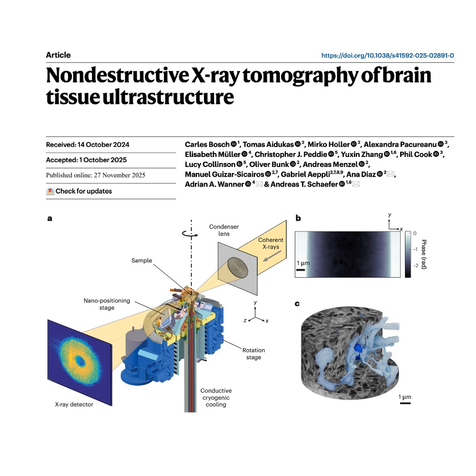So they took the same piece of brain, blasted it with X-rays, and then physically milled it with the traditional gold standard just to check for damage. They used EM to validate the X-ray imaging. Yes. And what did the FIB-SEM ground truth show? It confirmed that the X-ray irradiation, even at pretty high doses, did not noticeably impact the overall ultrastructure. That's huge. Crucially, subcellular features like membranes, mitochondria, the endoplasmic reticulum, they were all preserved. This validation was absolutely key to proving the imaging was non-destructive.